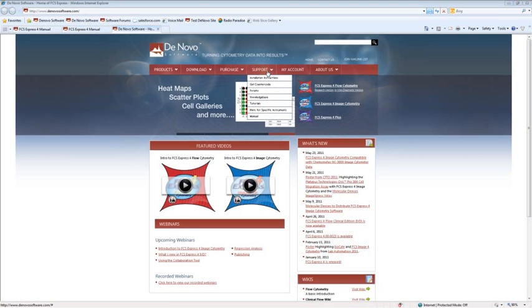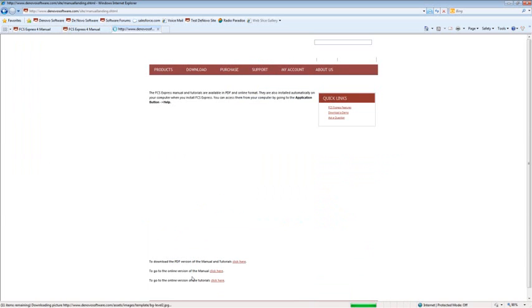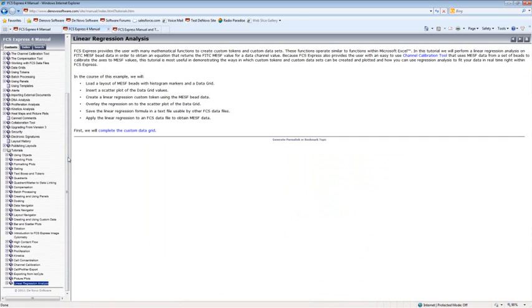You can find these in support and either in our manual page here or in the tutorial section. You can see down here that we have the online version of the manual and the online version of the tutorials. And here is the front page for one of our tutorials.